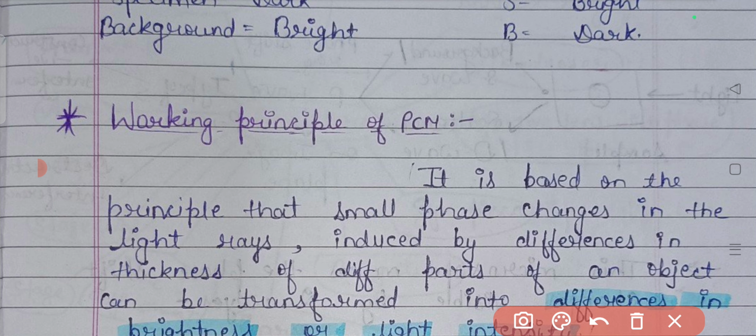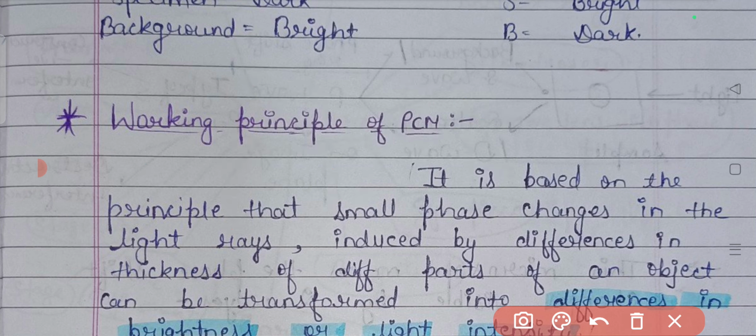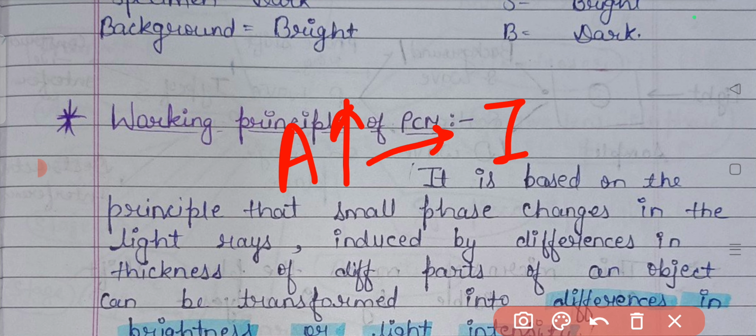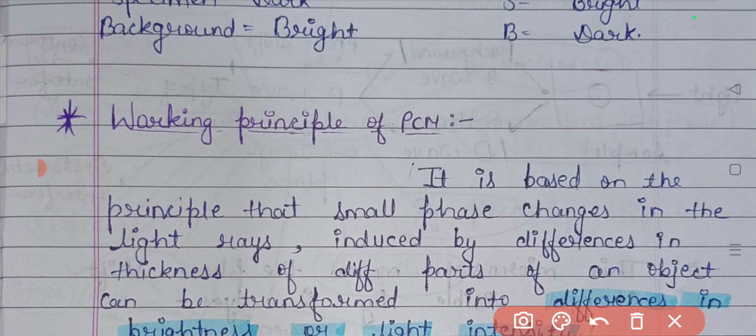So basically here the main point is related to the amplitude. Amplitude basically means that part. Okay, so amplitude, as we can establish a relation: as amplitude increases, intensity also increases. So we can say amplitude is directly proportional to the intensity of the light. Okay, we can make a conclusion as a result of this. So here we have discussed the working principle and the basic types of interference.